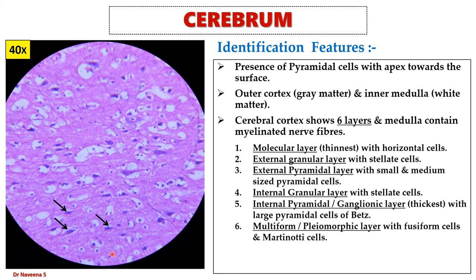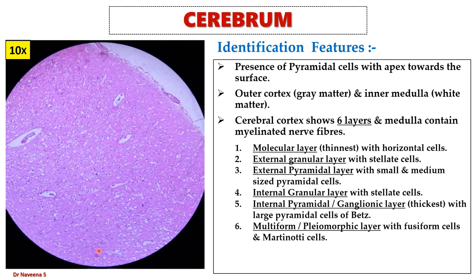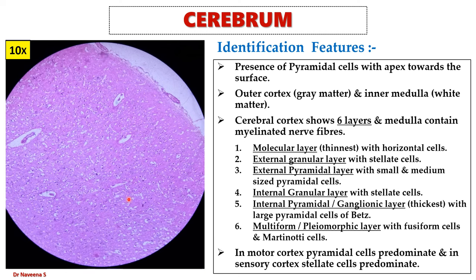Here is the medulla with nerve fibers and oligodendrocytes. Under low magnification, the different layers of the cerebral cortex can be identified by very few cells in the outermost two layers, small and medium-sized pyramidal cells tightly packed in the third layer, and large pyramidal cells or cells of Betz loosely packed in the fifth layer. Importantly, in motor cortex pyramidal cells predominate, and in sensory cortex stellate cells predominate.